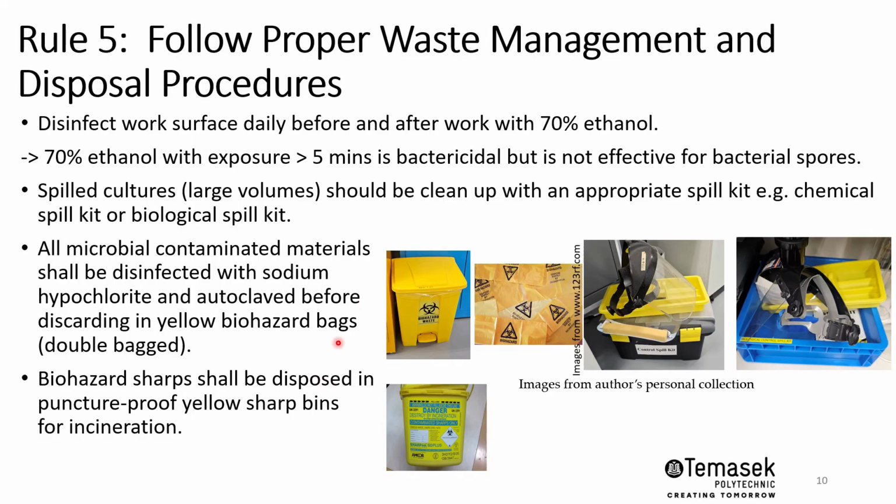All microbial contaminated material shall be disinfected with sodium hypochlorite, which is also known as household bleach. Once disinfected, usually overnight for more than 24 hours, they are subsequently autoclaved in yellow biohazard bags shown here. The bins that you see here on the left-hand side are the bins that you will find in our laboratory. Often we will discard the contaminated materials in double-bagged yellow biohazard bags, and subject them to autoclaving.